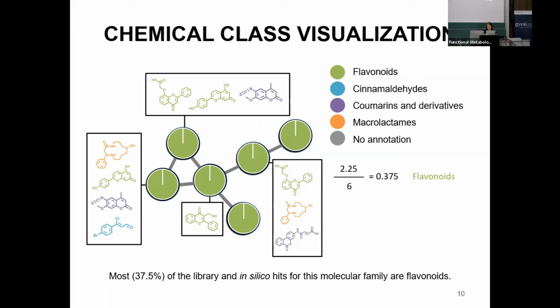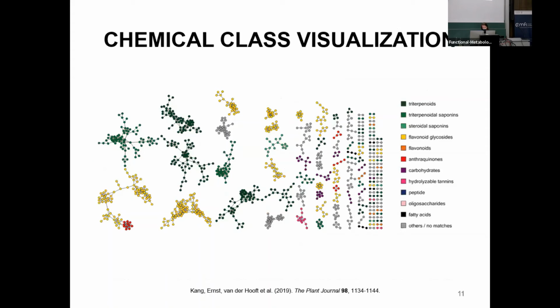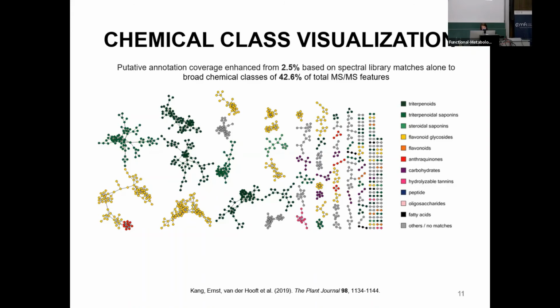So it's not the absolute class that's true, it's just a hint, basically. And so these most predominant chemical classes, they are calculated at all levels of the classifier ontology. And what you get back is what Justin also showed a bit in his slides already, these colorful networks where you can highlight different classes.